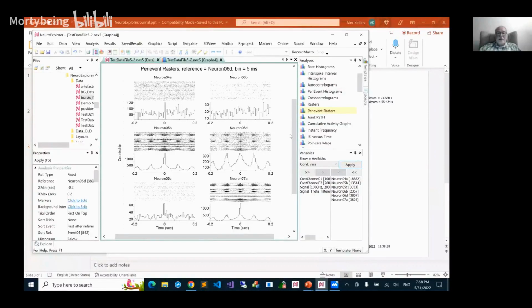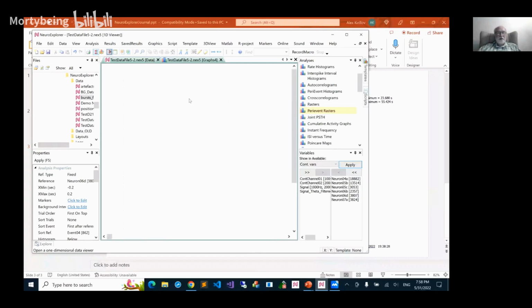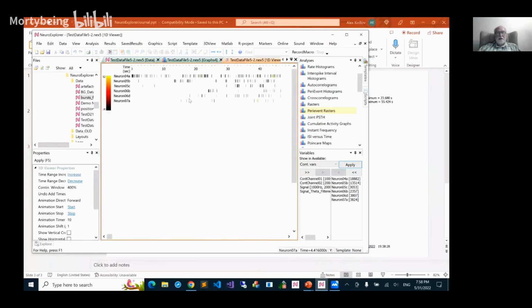Then the next step is, when we go back to the spike trains, we can ask a question: do we have any dependency? So are those spike trains independent, just random? Yeah, they look random. They have a typical neuronal distribution, a lot of short intervals, a smaller number of large intervals.